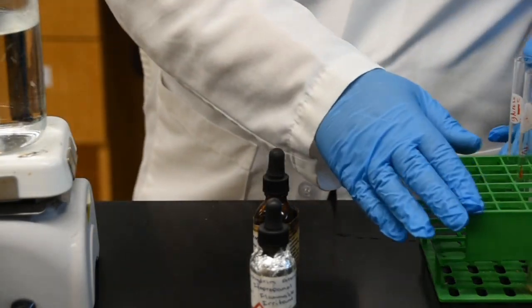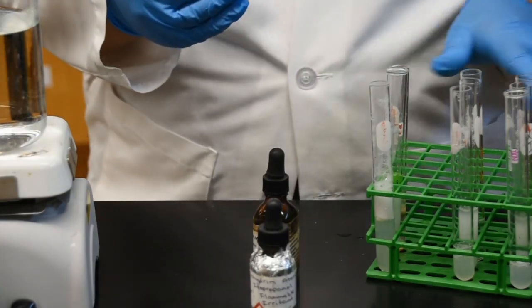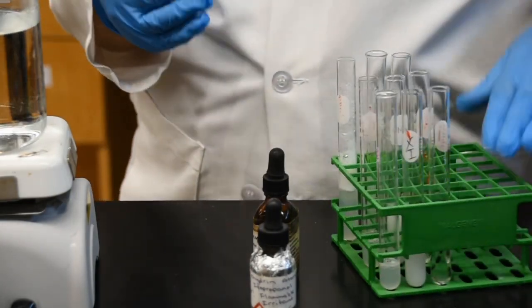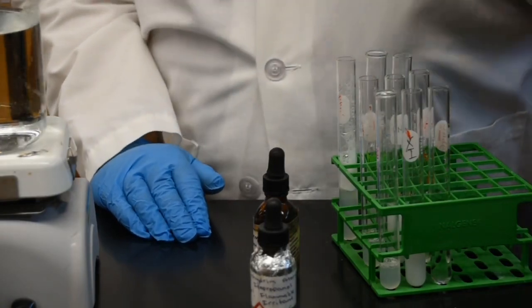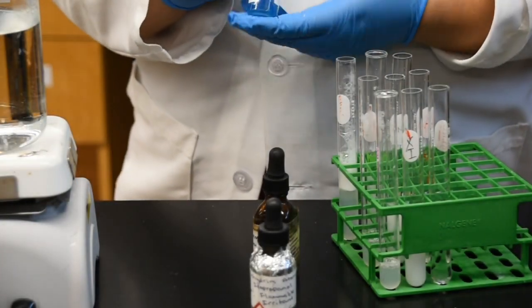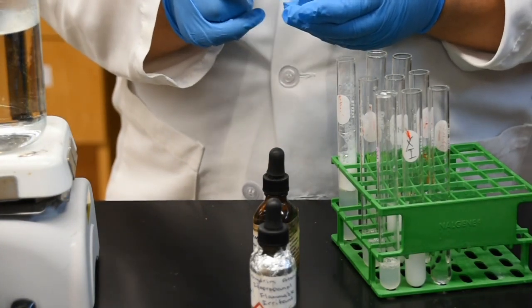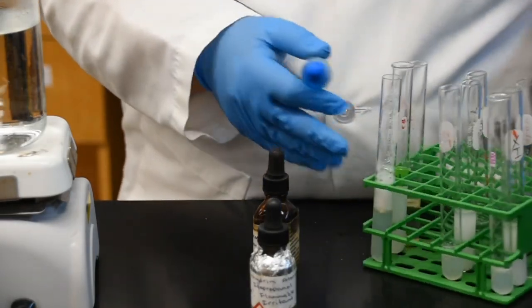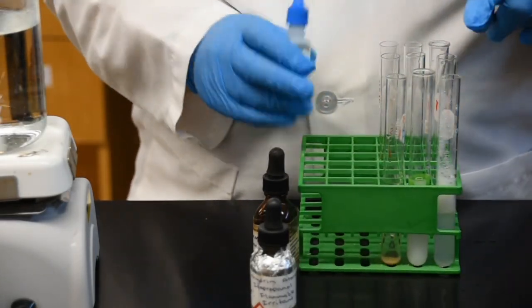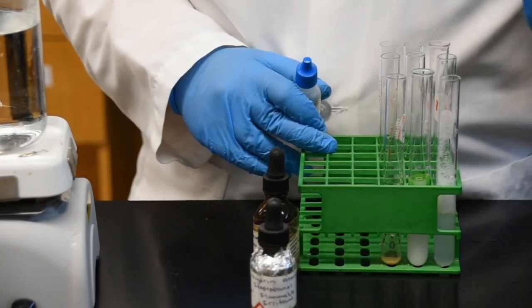For us to test this on a sample, we're going to run this experiment with our 3 indicators. I'm going to start with our Benedict. As a reminder, guys, Benedict identifies simple sugar when it's been heated. Right here in my tubes, I have 3 samples. The first one is a protein solution.